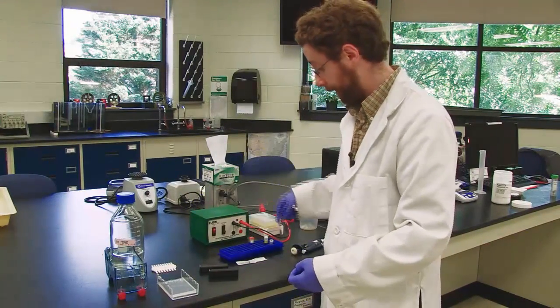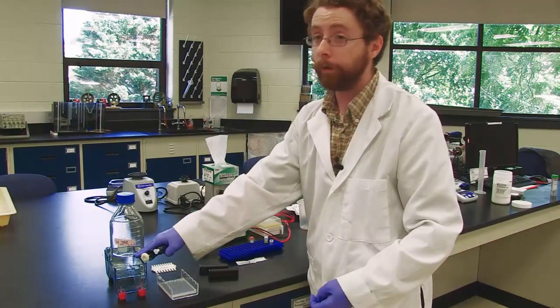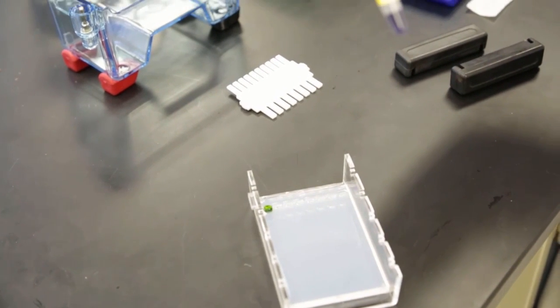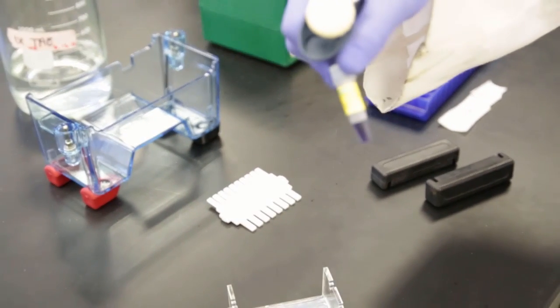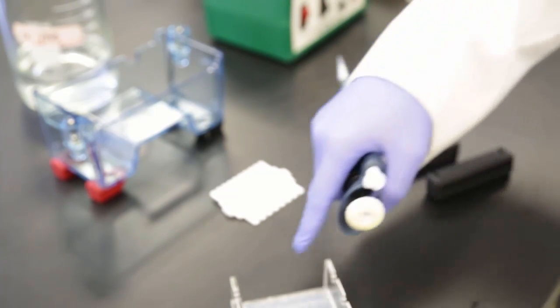So I'm going to now take my DNA and I'm going to load it directly into the gel before it goes into the gel box. We've loaded our DNA sample. Now we're going to add our DNA ladder. And the DNA ladder, many of them come commercially prepared and already have the loading dye added to it. So here I'm going to add 5 microliters of my DNA ladder into the next well.